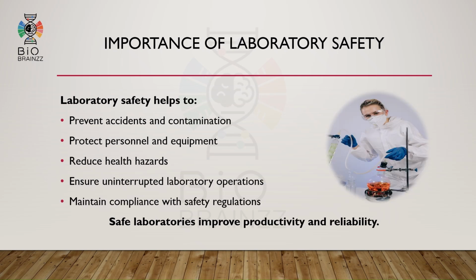Now, let us discuss why laboratory safety is important. In laboratories, people work with chemicals, biological materials, electrical equipment, and sometimes hazardous substances. If safety procedures are ignored, accidents may occur, contamination may spread, and laboratory work may stop completely. Good laboratory safety improves productivity, reliability, and confidence in scientific work.